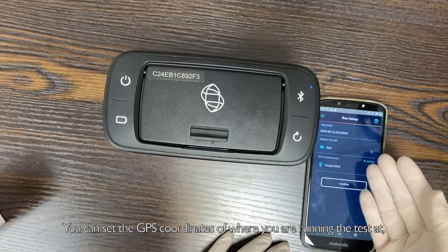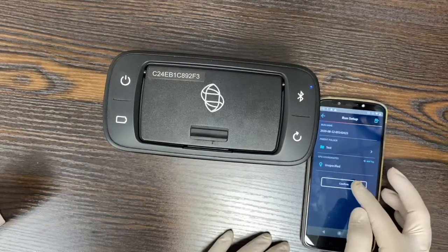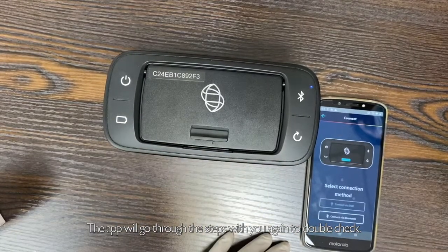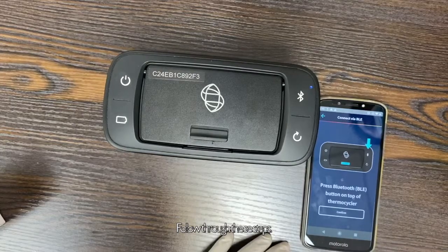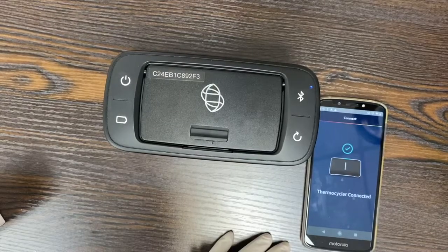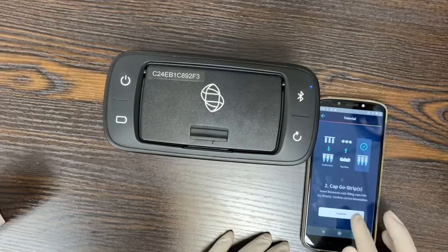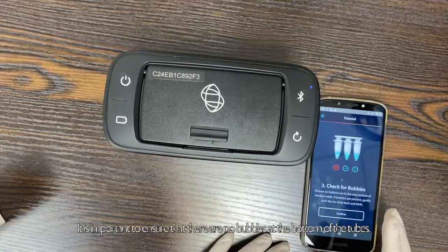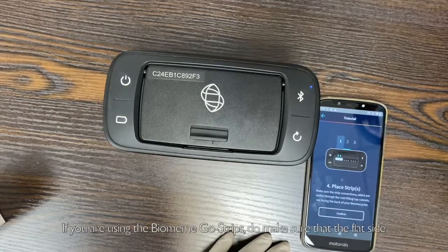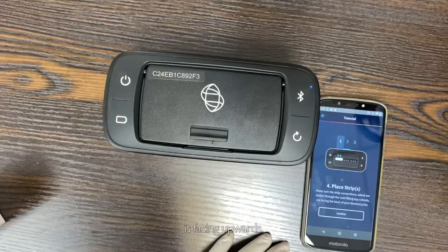You can set the GPS coordinates of where you are running the test if required. The app will go through the steps with you again to double check — follow through these steps. It is important to ensure that there are no bubbles at the bottom of the tubes. If you are using the Biomim Go strips, do make sure that the flat side is facing upwards.